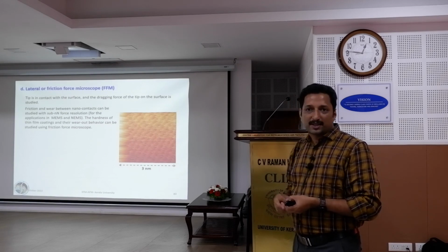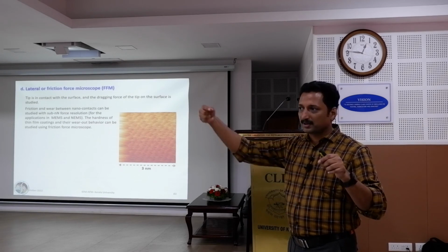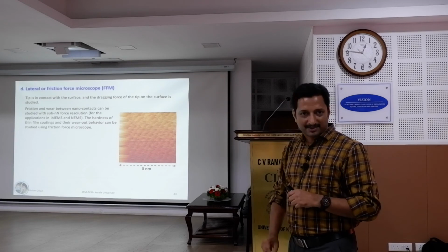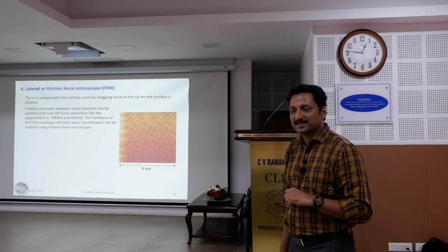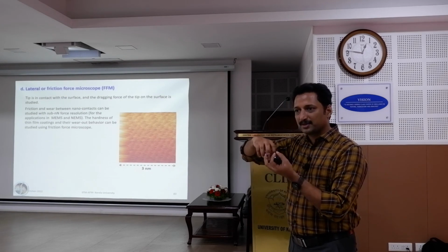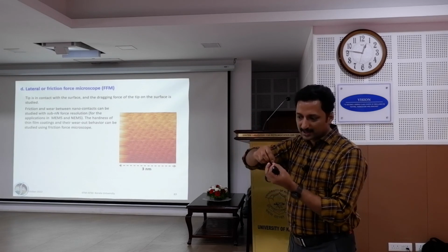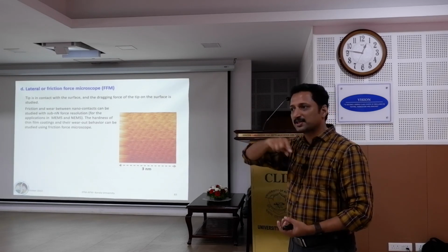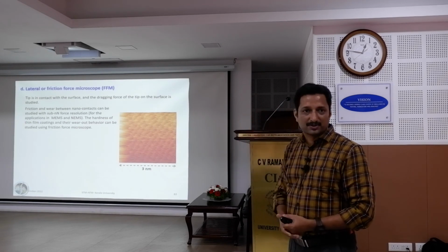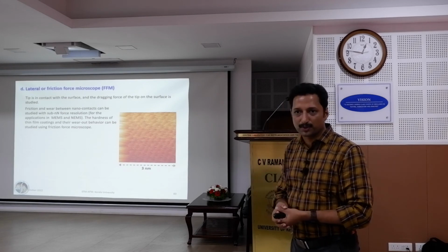Okay, what I can do is fix one edge of the protein on the surface, another edge on the AFM tip, and slowly pull it. Okay, it's happening. A lot of work is already published on that. You can actually see every time one fold is opening up, you see a jump in the force. Like that, until it completely stretches out, you can see how many nanonewtons of force. It's only nanonewtons or piconewtons, a very small force if you take one molecule.